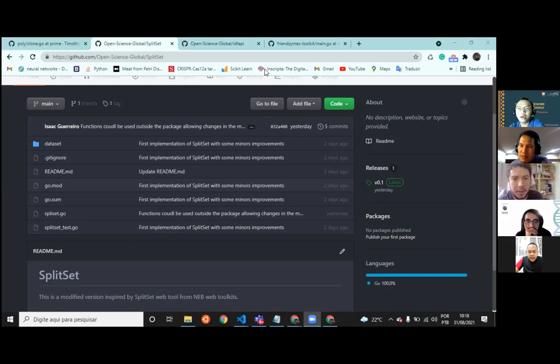Good. I think we could make a document where we share the ideas together to sample every sequence. But I think nanopore sequencing is a good choice because there are new algorithms being developed right now that can directly detect epigenetic modifications, because it's sequencing the DNA or the RNA in its native form. So the electrical signal variation based on those epigenetic modifications is readily available even in old data sets. That would be interesting.